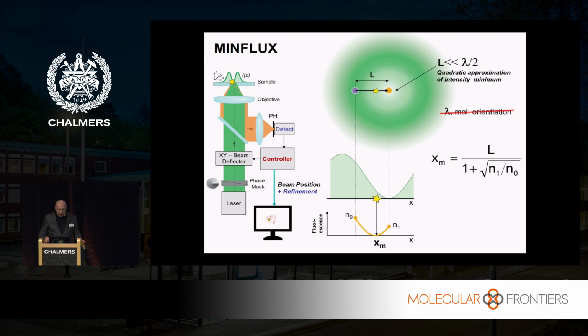You will know that this fluorescence emission is a dipole emission, and then the orientation of the molecule matters. And this is a big problem for this PALM STORM concept, because due to this, the resolution can be degraded by 10, 20 nanometers, even more, because the centroid of that diffraction pattern is off by 20 or 30 nanometers. No one has sorted out this problem yet, so it's sometimes pulled under the carpet, but here it's inherently gone.